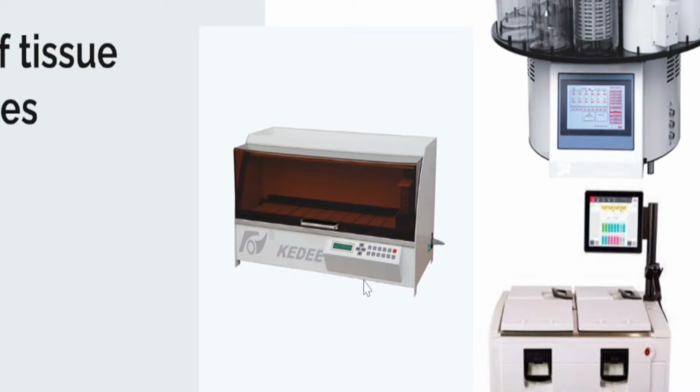So the types of tissue processors that you have are carousel, linear or bucket processors, and lastly your liquid tissue processors.